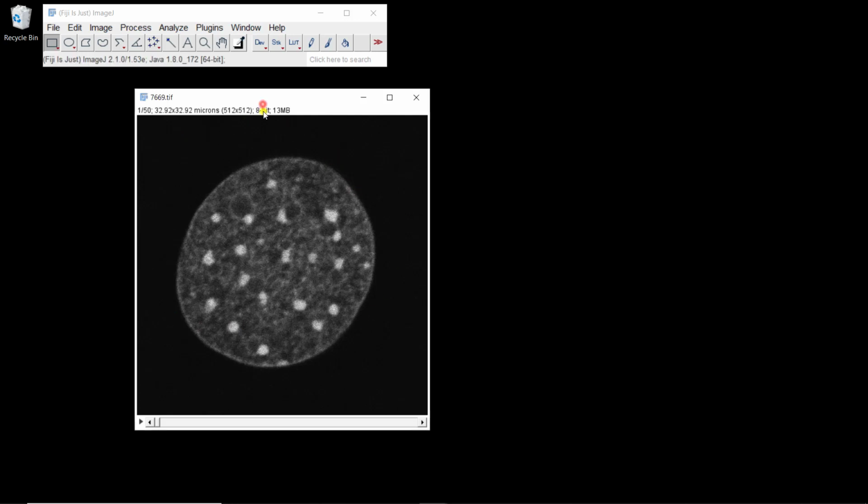If you want to do it manually, you can just use the polygon region of interest, and then you define points that are on the border of your shape. Okay, so I'm going maybe not extremely precisely to go a bit fast, but you get the idea.